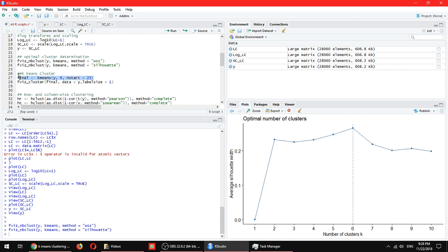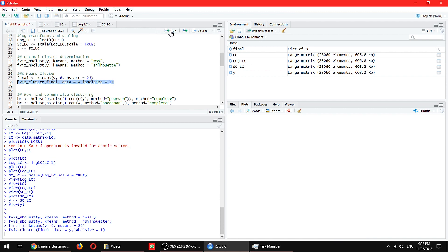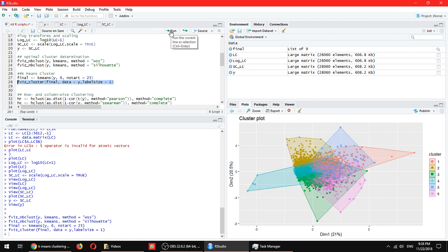Just to let you know how you can actually generate that. So the clustering is really fast. It takes like a second. And this one, fviz_cluster, just plots the clustering result here.